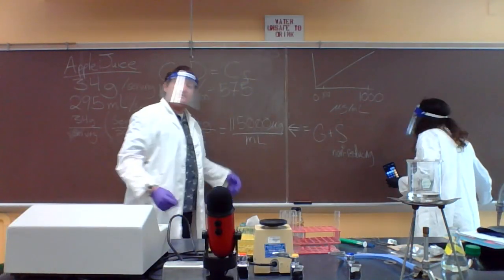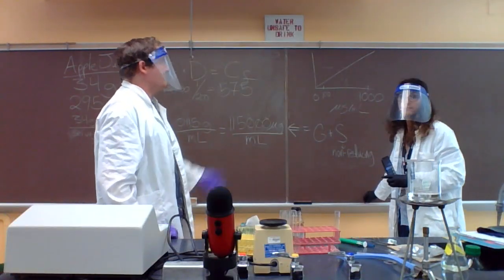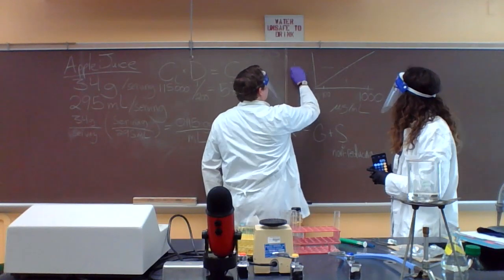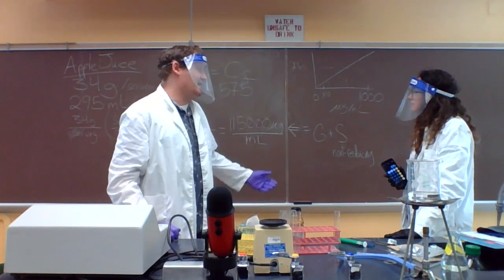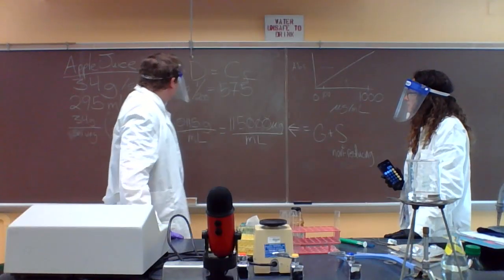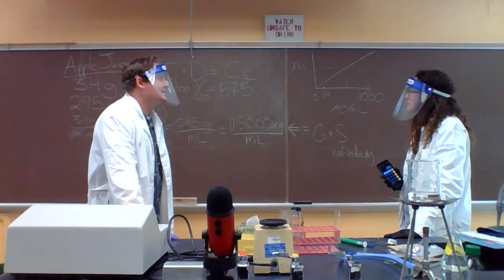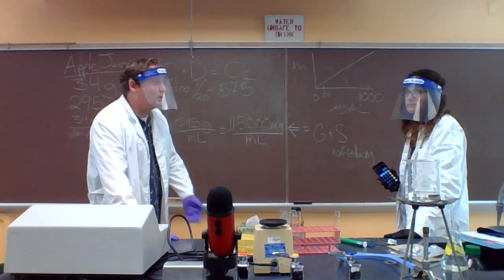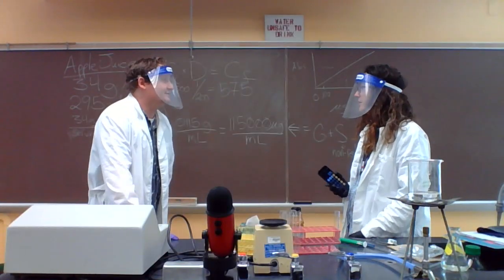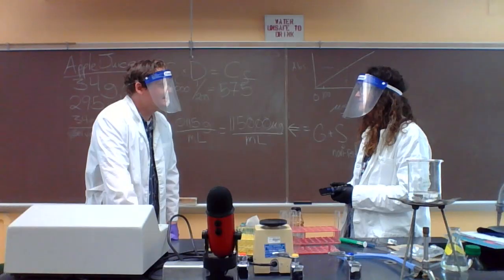And just for best practice, somewhere around here, yeah, it's perfect. And remember, absorbance is going to be here. We'll measure that, and that will give us our value of concentration. And best practice is to have 2 different dilutions usually for something like this, set apart by a little bit. So that's why we're doing a 1 in 500 and a 1 in 200. Yeah. So can I just take 1 milliliter and add it to 500 milliliters?